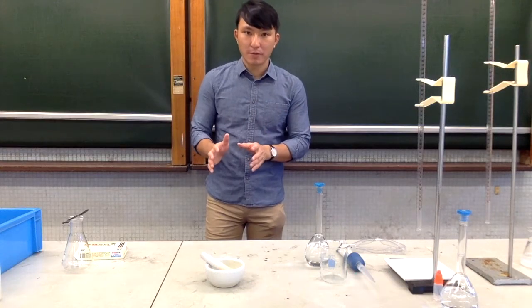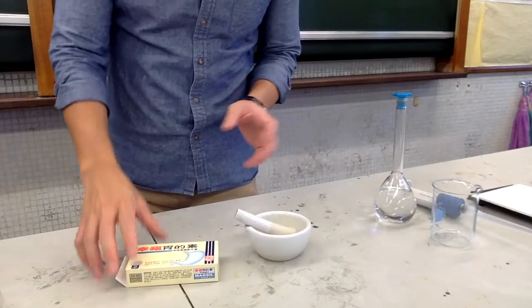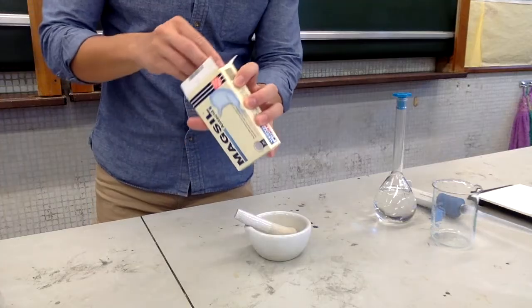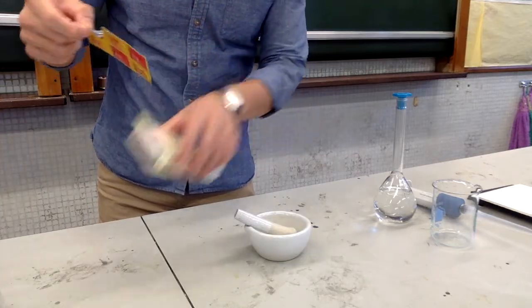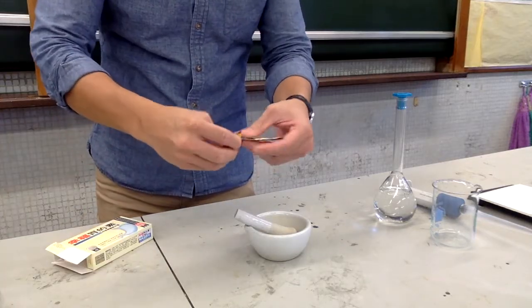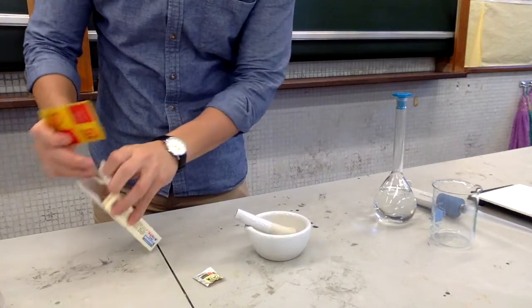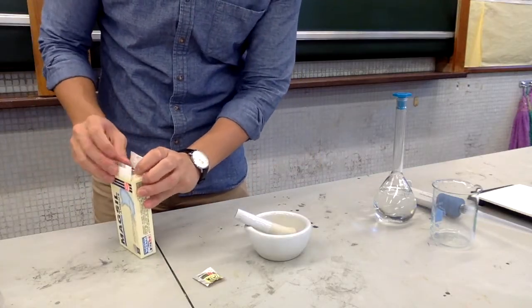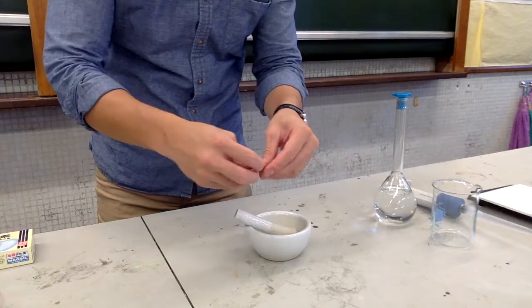First of all, we are going to take one antacid tablet and we will grind it into powder using mortar and pestle.